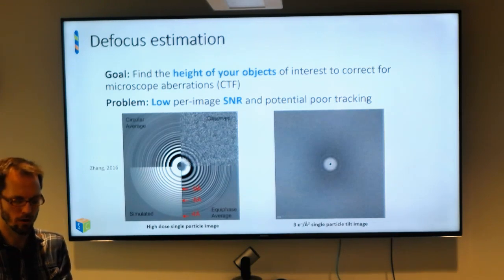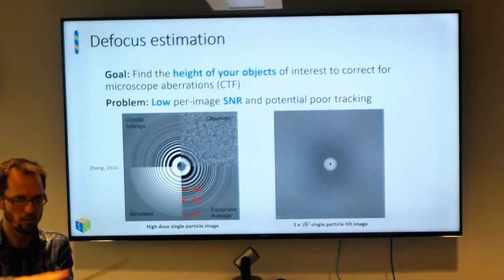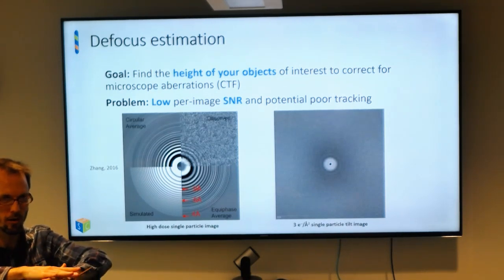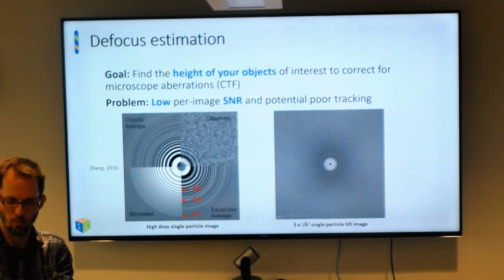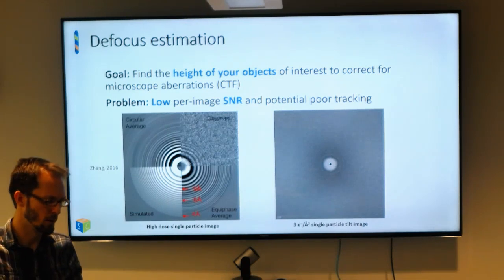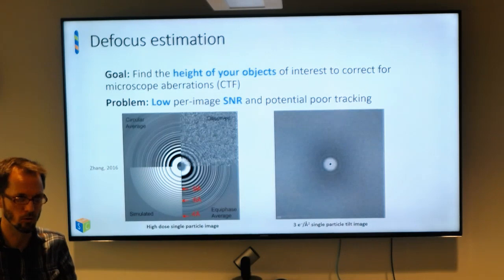What the fiducial alignment dual tilt axis does is it aligns this tilt series, and then it aligns this tilt series, and then it combines those two aligned tilt series. What Tomo does is that back and forth algorithm, except for, I think, all 4 directions. So it may be an unfair comparison, but it does do better in practice in dual tilt.